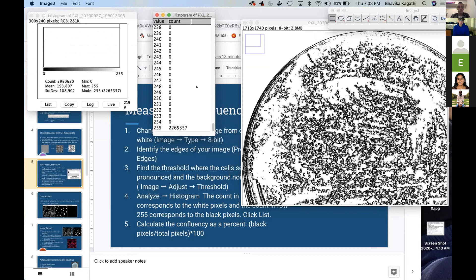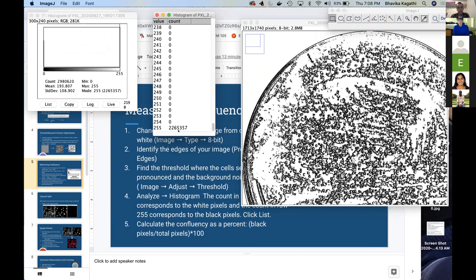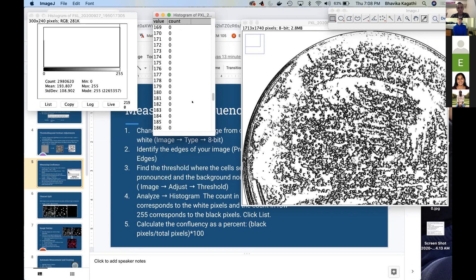And so the number down here is the amount of cells in total, and then the number up here is the amount of pixels in black. So it's going to give us the amount of pixels in black versus the total amount of pixels.